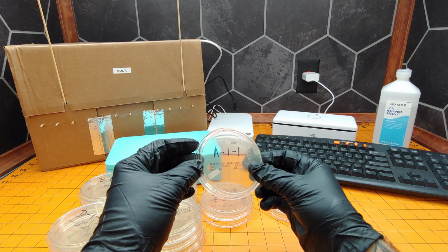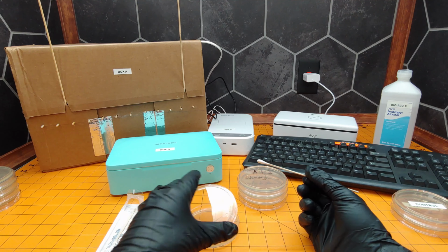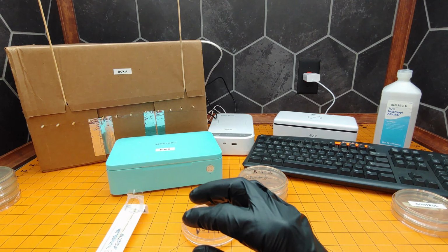So first we have A11. This is pre-sterilization sample number 1. We're going to take one of our sterile swabs and we're going to pick a key on the keyboard. I'm going to start with the X key. So we're going to get a good rub of the X key, and then gently drag it across our A in a plus sign. This is now trash. Our A11 is now complete.